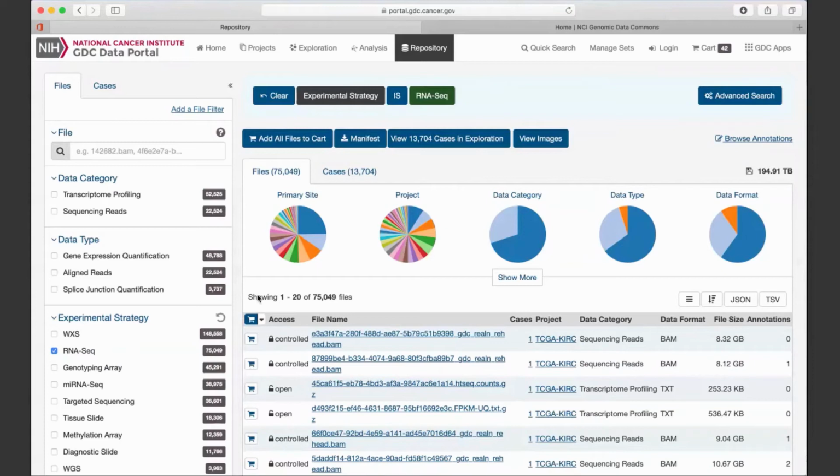Okay, another question: how are mutations aggregated from different software? Oh, that's a hard question, actually. As Colin mentioned, we have multiple somatic variant callers, and they each have their own unique calling set and also some common set. For the aggregation, we first take every calling set and only look at what this caller thinks is a good mutation.